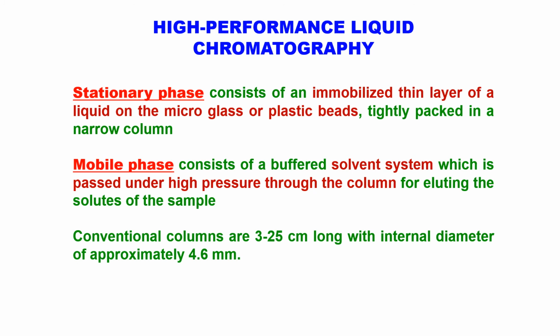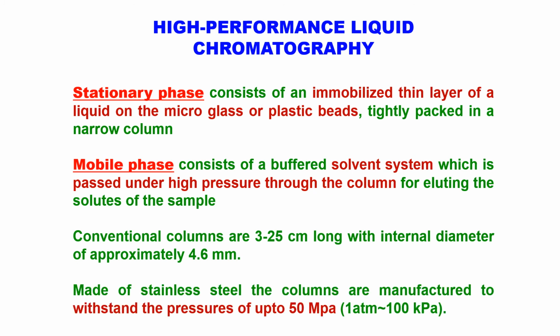So the pressures of as high as up to 50 megapascals need to be applied to the columns, and since this high level of pressures are applied, this makes this chromatographic technique a high performance chromatography.